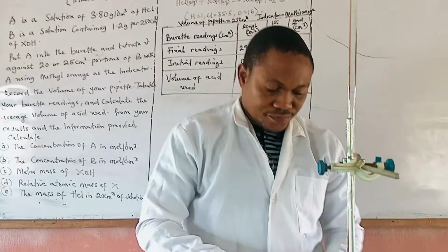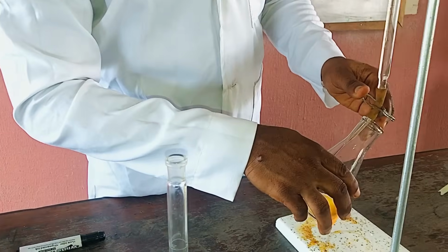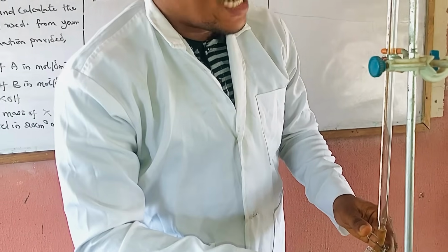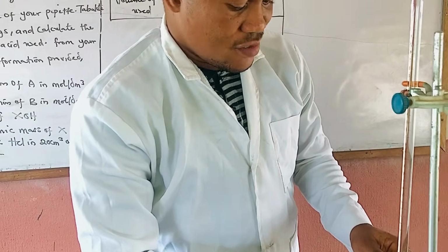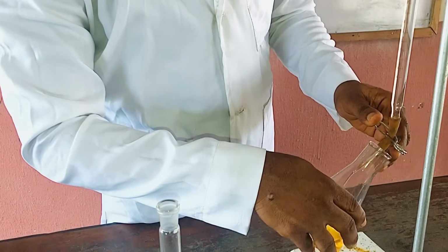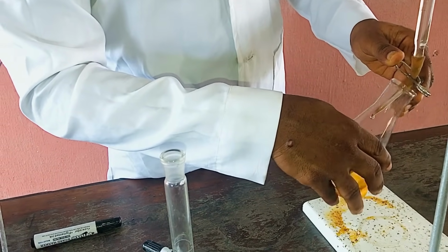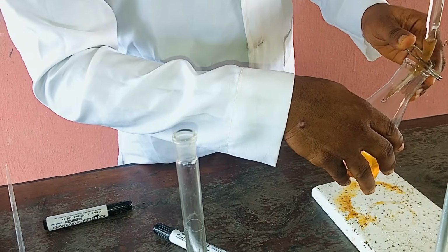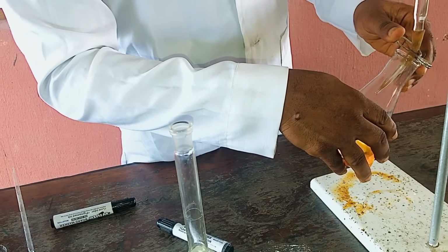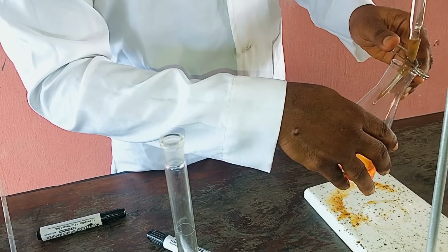Next titration. Very important. So you already know the range. Your rough will give you an idea of what the range is. Okay, so because you are time constrained, we run it down. Gently now, gently, okay, gently, you can see that, gently, gently.